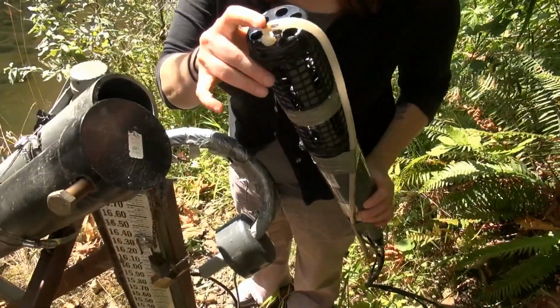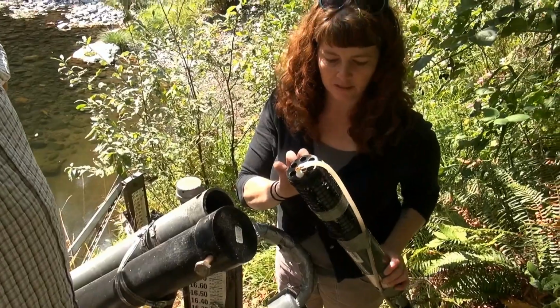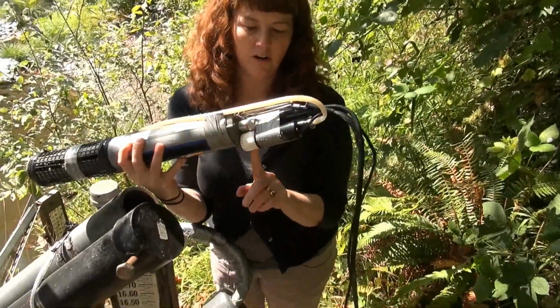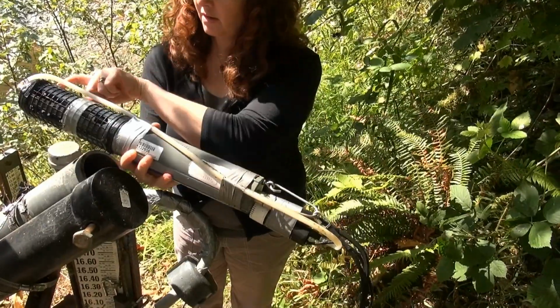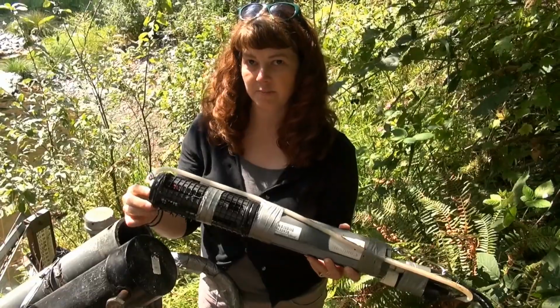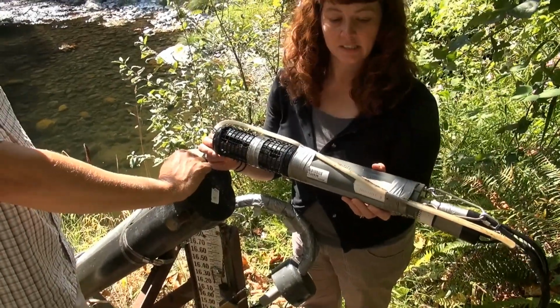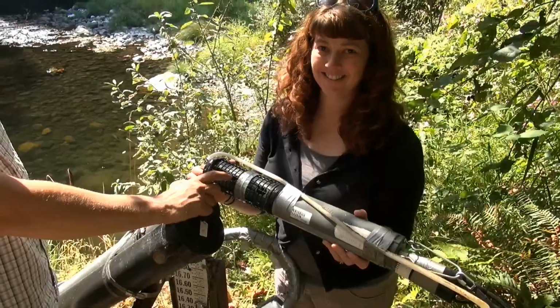And then this is the pump system that we came up with for cleaning the turbidity probe because we were getting biofouling in the summertime. It's just like a little aquarium pump, and the intake is right here. So you're just blowing straight water? Every 2 hours, just blowing water straight at it, for a minute, and it seems to have been really effective. Because we were getting fouling within days, cleaning it.